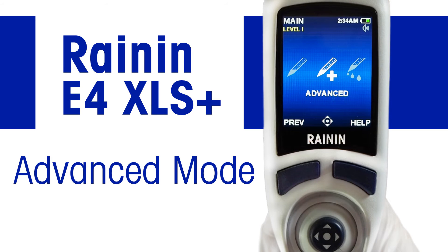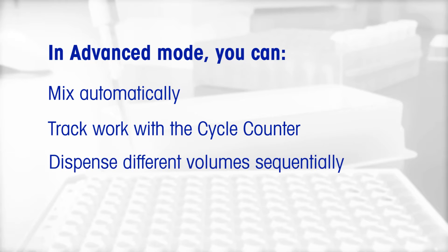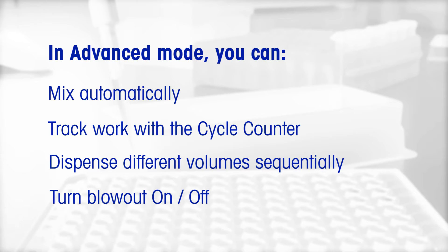Advanced mode. In advanced mode, you can mix automatically, track your work with the cycle counter, dispense different volumes sequentially, and turn blowout on or off.